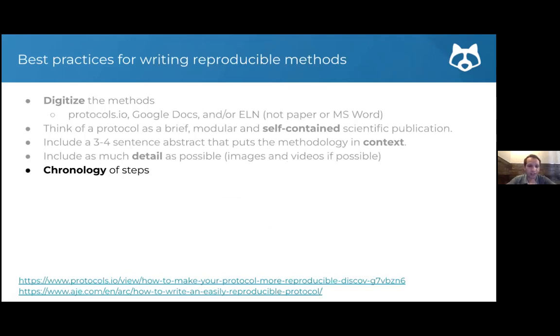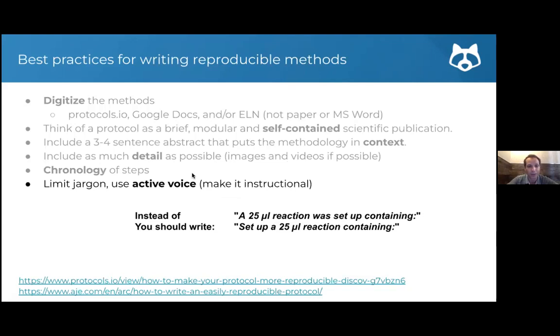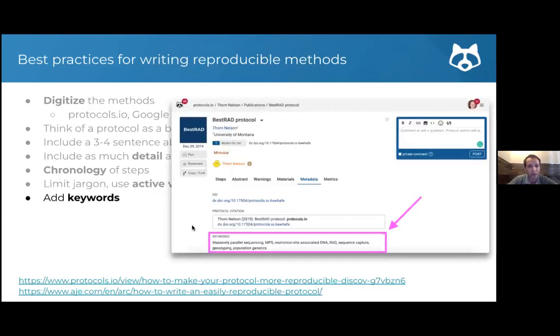Don't just, the method sections unfortunately have past tense, everything condensed into paragraph forms. That's not what a protocol looks like. That's why I recommend Protocols.io and they're so partial to it. So don't learn from method sections and the condensed paragraph form. Have step-by-step instructions, use active voice in a protocol instead of the past tense that research papers typically require.